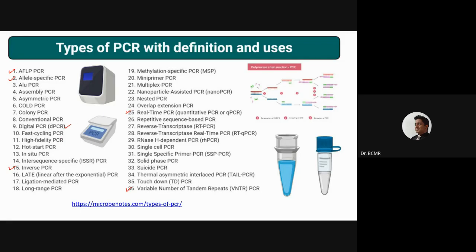And yeah, we finished reverse transcriptase. We finished real-time PCR. Many other topics have been finished. But otherwise, you can go through them if you want to, but it's not mandatory. They're highly specific for a particular purpose. And sometimes the same technique can be referred to by different groups in different ways. Sometimes that is also a problem. Because this is a topic in our syllabus, that is long range PCR.